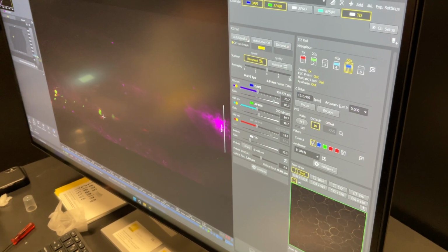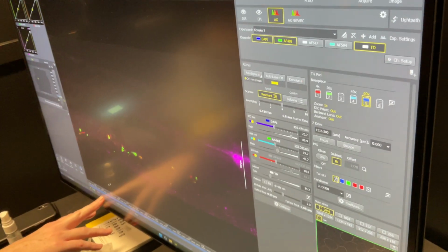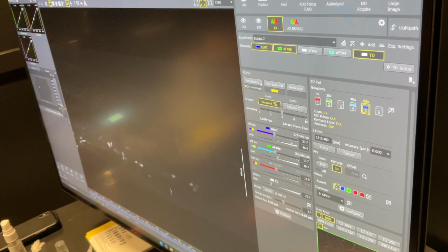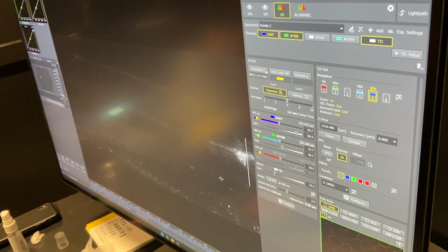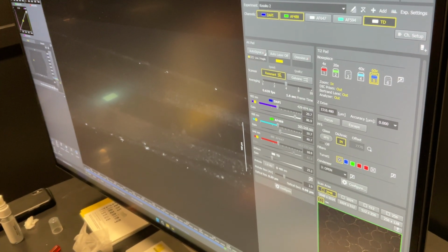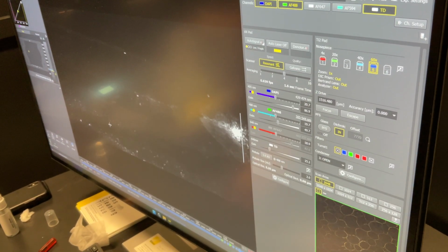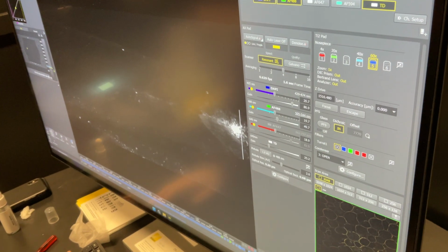Okay. So basically, you've got populations of cells. They're all red, but some of them are going to have far red in them. Well, I think the far red is pretty ubiquitous, it's in everything, but it's like a LysoTracker. It's enriched in the... Well, I just care about it in the macrophages.